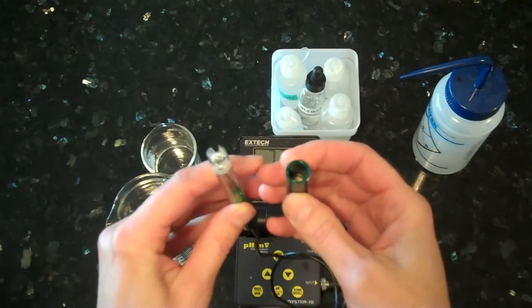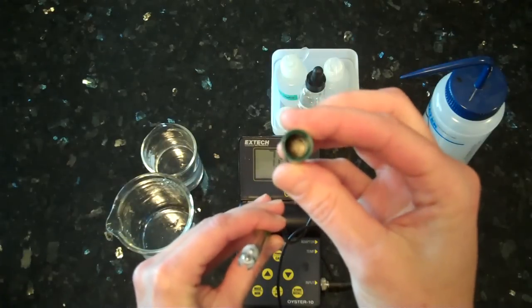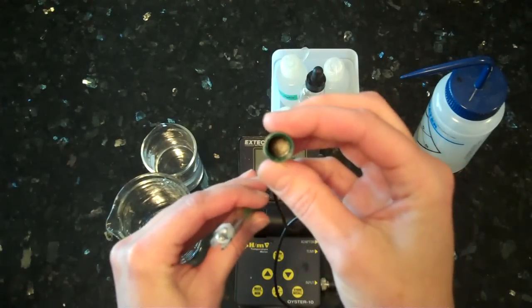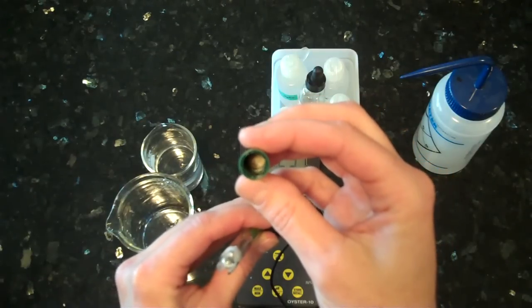There are a couple of things you should know before you begin. One is that if you look inside the cap, there's a little sponge, and that sponge, when you are all done using the pH meter, needs to be saturated with the pH 4 solution.